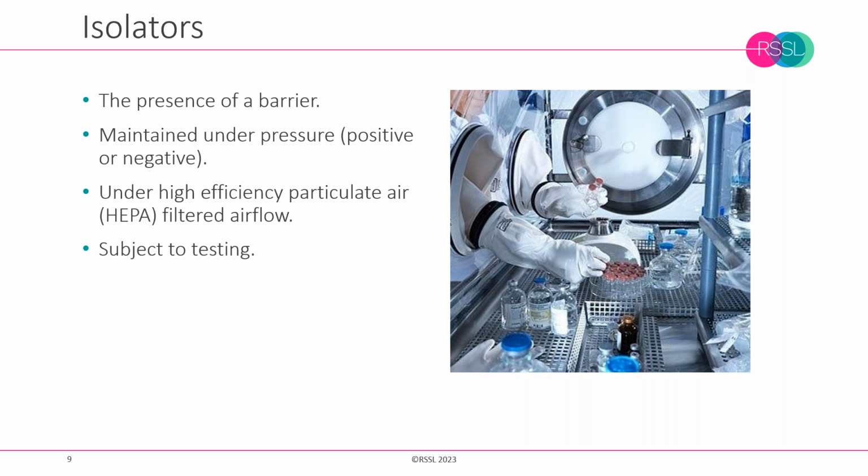And all isolators to a slight degree will leak air. The important thing is ensuring the minimisation of leakage, because excess leakage of air could lead to the ingress of air from the surrounding environment, which is going to have a level of contamination. So we need this pressure monitoring, this ability to leak test and assess the isolator integrity, and also inside to be confident that we have HEPA filter integrity.